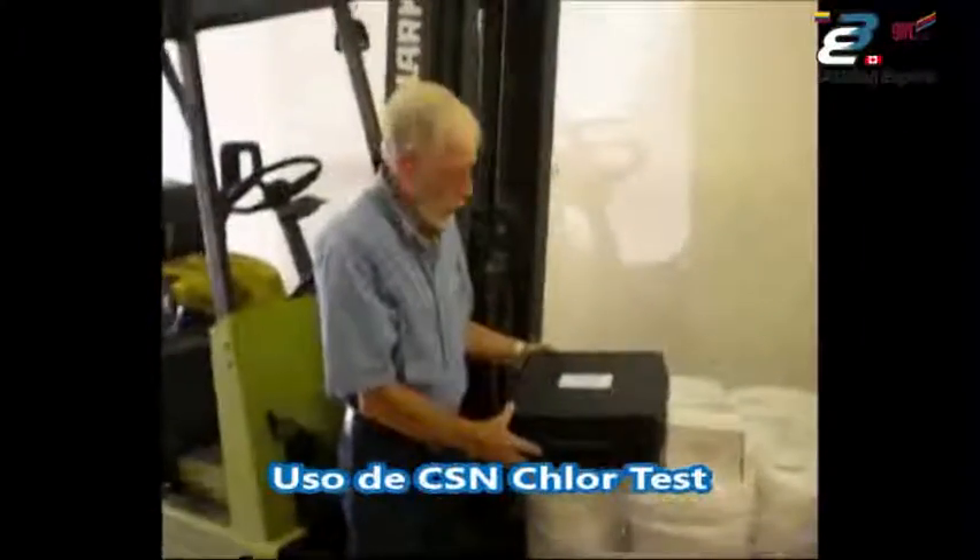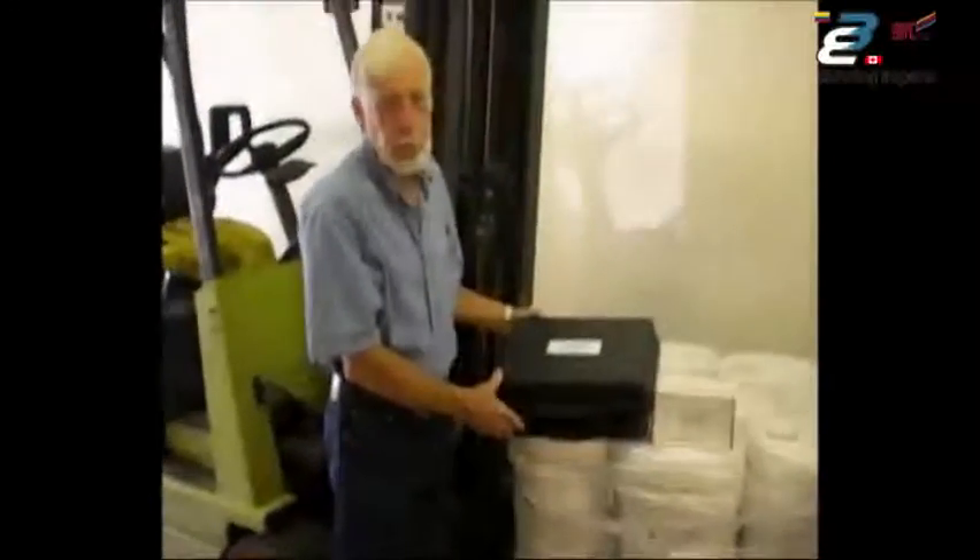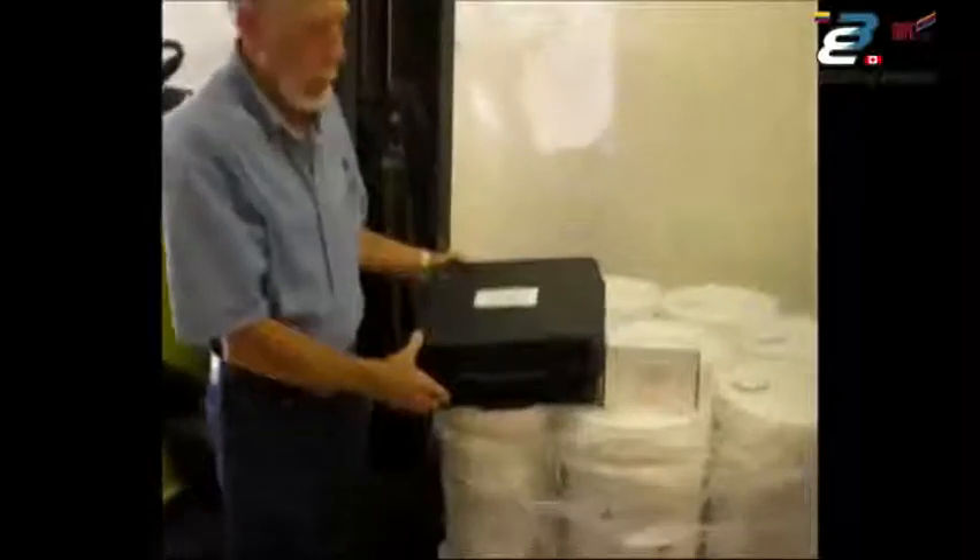We're going to go through the CSN Salts Chlor test kit, listing the components and how they're used, and actually perform a test so you can see how it's done.